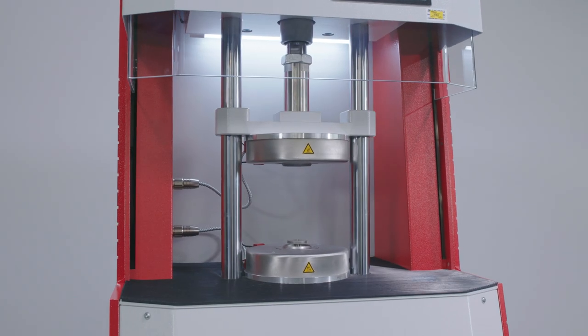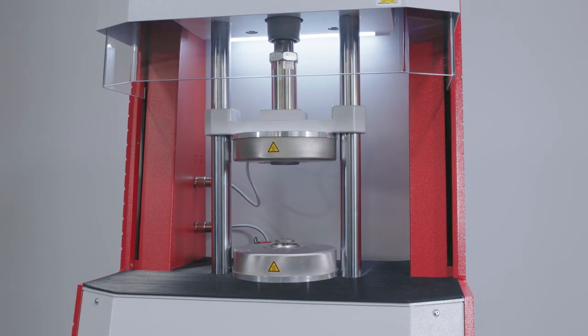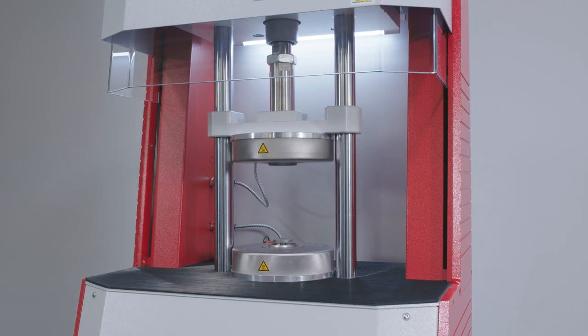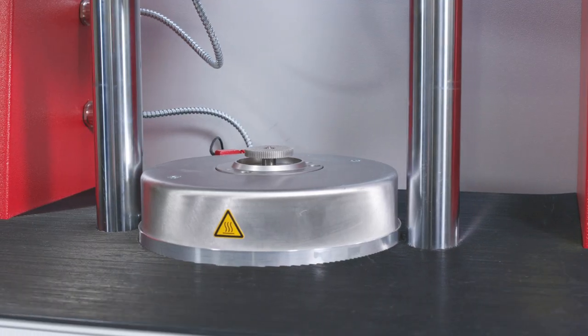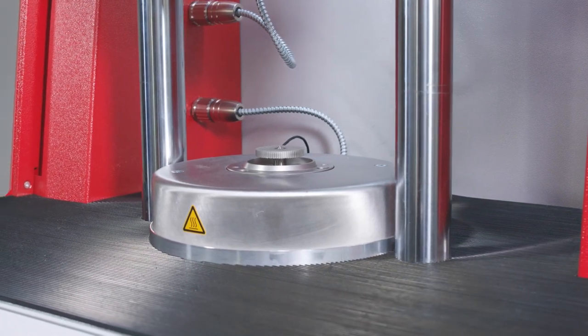The instrument's frame is constructed from solid aerospace grade aluminum and stainless steel. Additionally, it features the largest working area of any Mooney viscometer in the market. Whether placed in a laboratory or mixing environment, the MV3000 is built to last with minimal preventive maintenance.